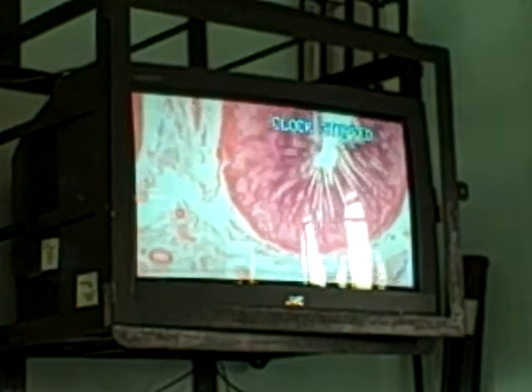Kaya lang, Mang Raquel, pahingi po nung old duodenum. Old luma duodenum. These are new slides wherein they submitted a portion of duodenum without the gland in the submucosa.